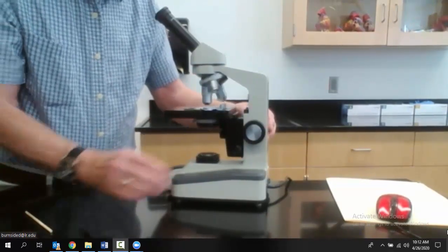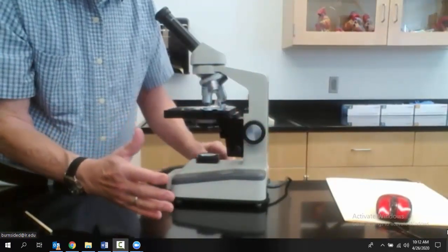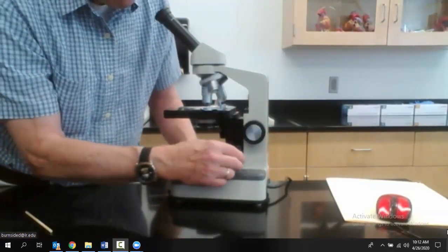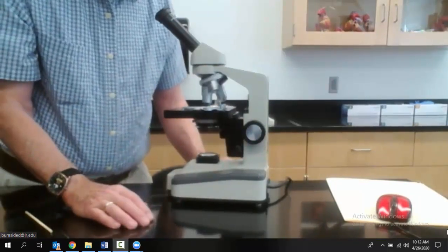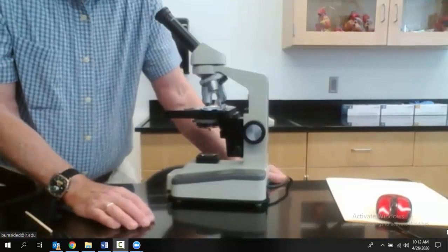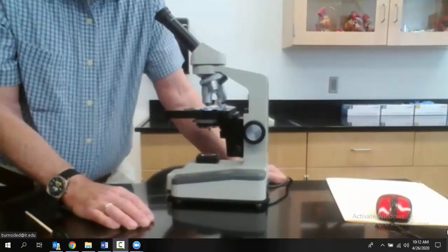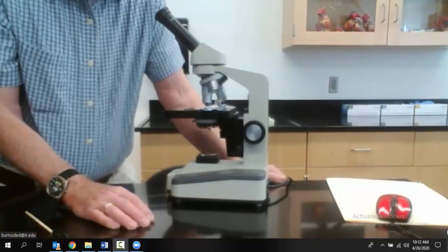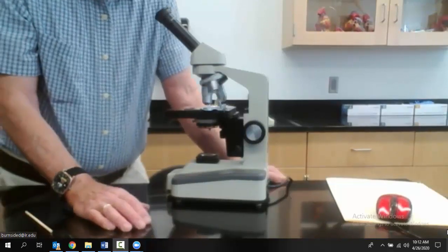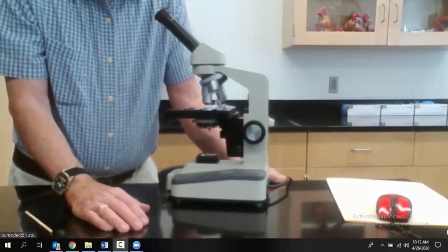Then we focus first with the coarse adjustment until we get it into approximate focus, and then with the fine adjustment. It's very important to realize that histology, the study of tissue, is very important, because you could not know the organs and whether they were functioning properly without some good histology.